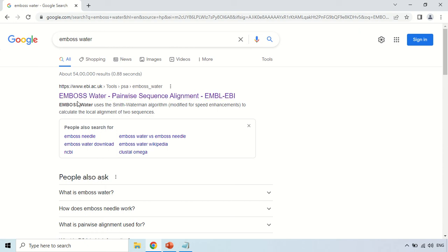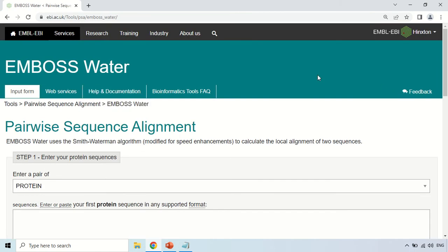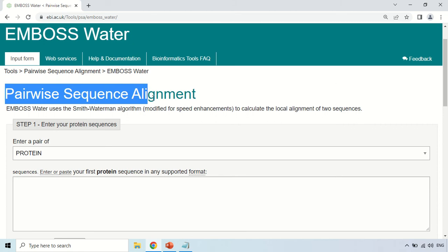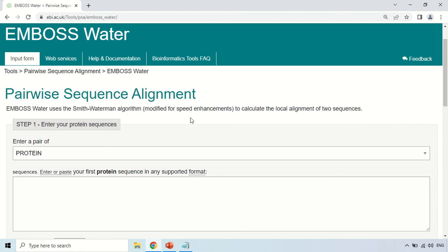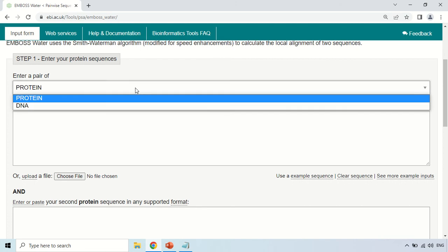Click on the website starting with EBI and you will be on the home page of EMBOSS Water. This tool performs pairwise sequence alignment. In the first column, you have to choose what type of sequences you have — you may either have protein sequences or nucleotide sequences — and you can change it according to your sequences.